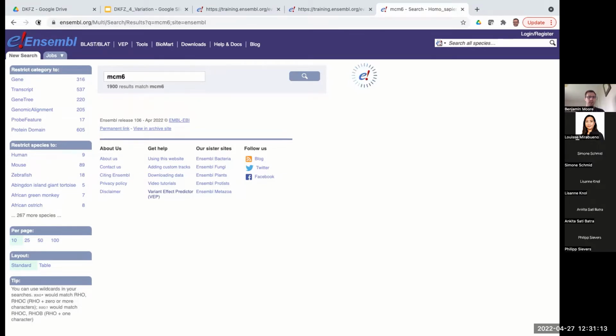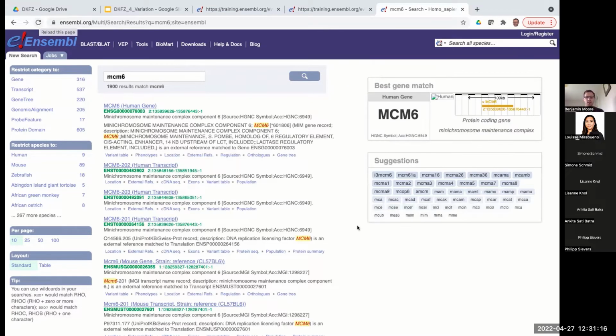Okay, so we did report this issue to the web team yesterday, but hopefully the website should be working better than it was yesterday. If you are having problems, or if it's going too slowly for you, then remember the mirrors that we spoke about yesterday. You can use the US West, the US East, or the Asia mirror as well. It looks like the page is loading for me. We'll see how quickly the different pages load.